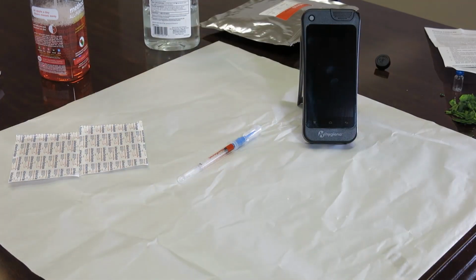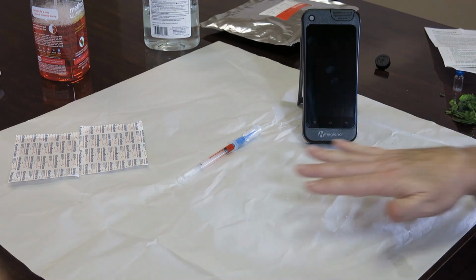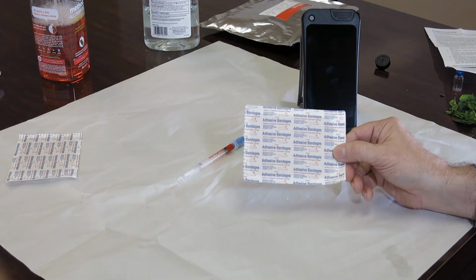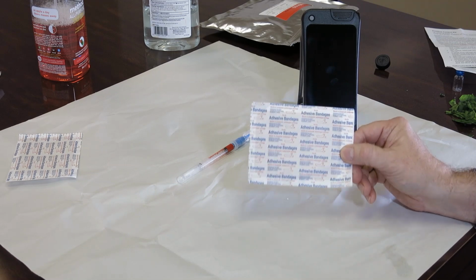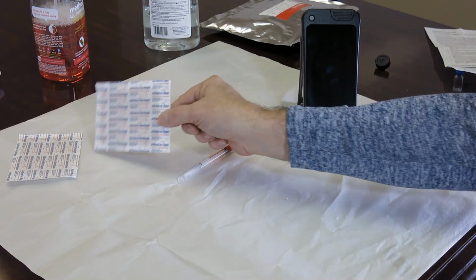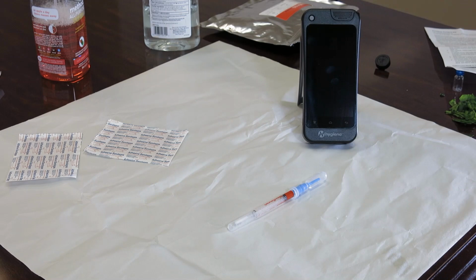In this series of tests, we're going to do a negative control, a positive control. We're going to treat an area with spinach, and we're going to measure that. Then we're going to clean that area and measure that. And then for a final test, we're going to use the inside of a sterile adhesive bandage and use the ultra-snap monitoring swab on the inside of that and see if we can find that to be a good negative control.